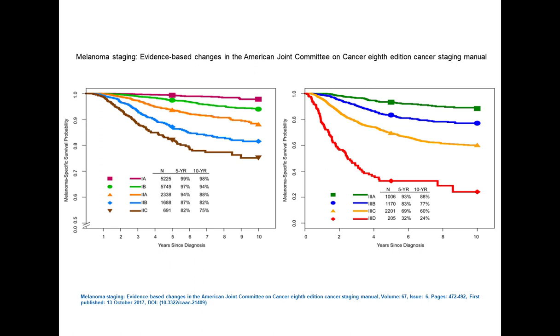The intratumoral molecular heterogeneity in stage 3 melanoma has already been analyzed with an array of analytical approaches, including gene expression analysis, immunohistochemistry, and proteomic approaches. Single-cell RNA sequencing is a powerful tool for addressing transcriptional heterogeneity, but knowledge about the spatial origins of single cells is vital when studying the tumor microenvironment. We therefore aim to optimize and apply the spatial transcriptomics technology for the in situ and quantitative detection of gene expression in stage 3 melanoma lymph node metastasis.